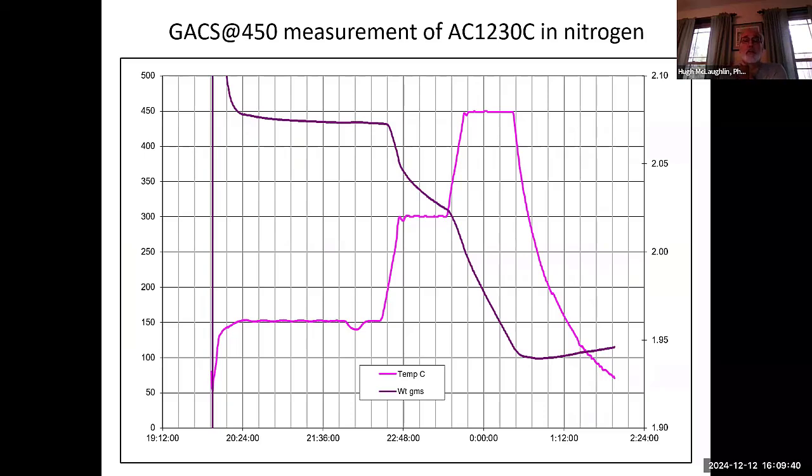This is a standard carbon that I use that is nice because it tends to have a little bit of everything in it. It's got a lot of moisture that comes off. It's got VOCs, that middle swoop, and then SVOCs. And then at the bottom, when it cools off, you actually see some temperature, some weight gain, and that's because the balance is being influenced by the temperature underneath it. Not a huge drift, but something you can see.